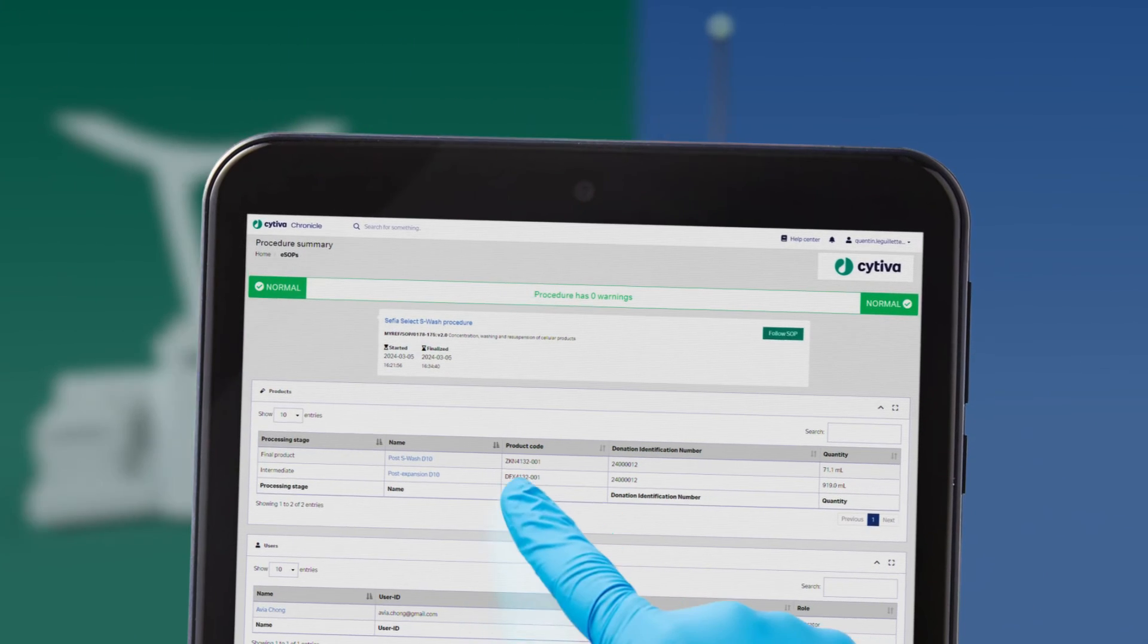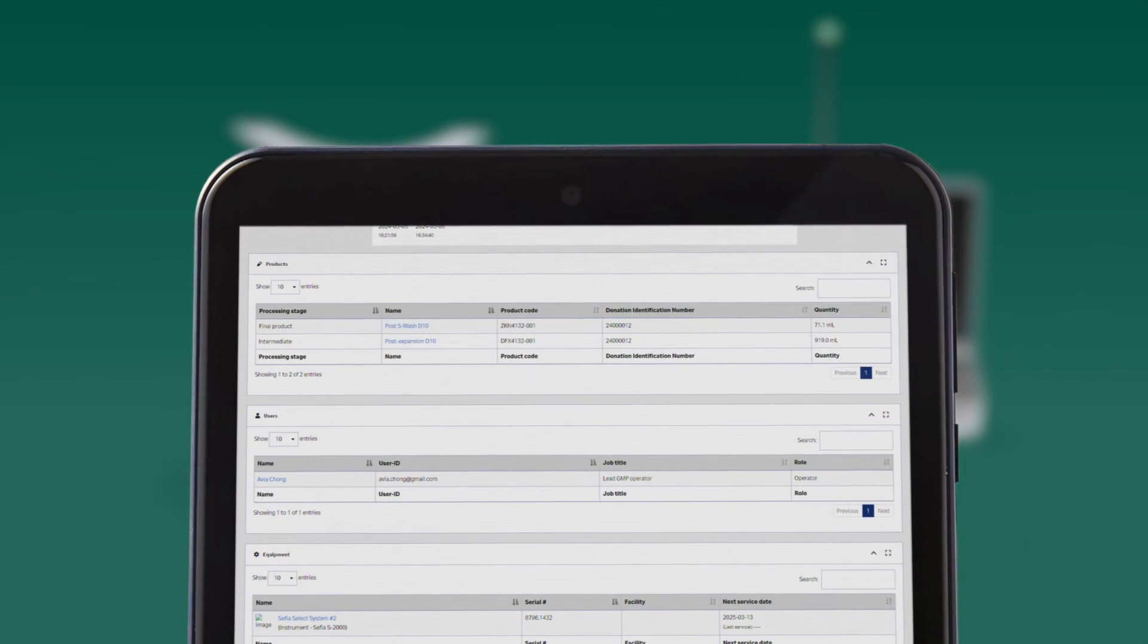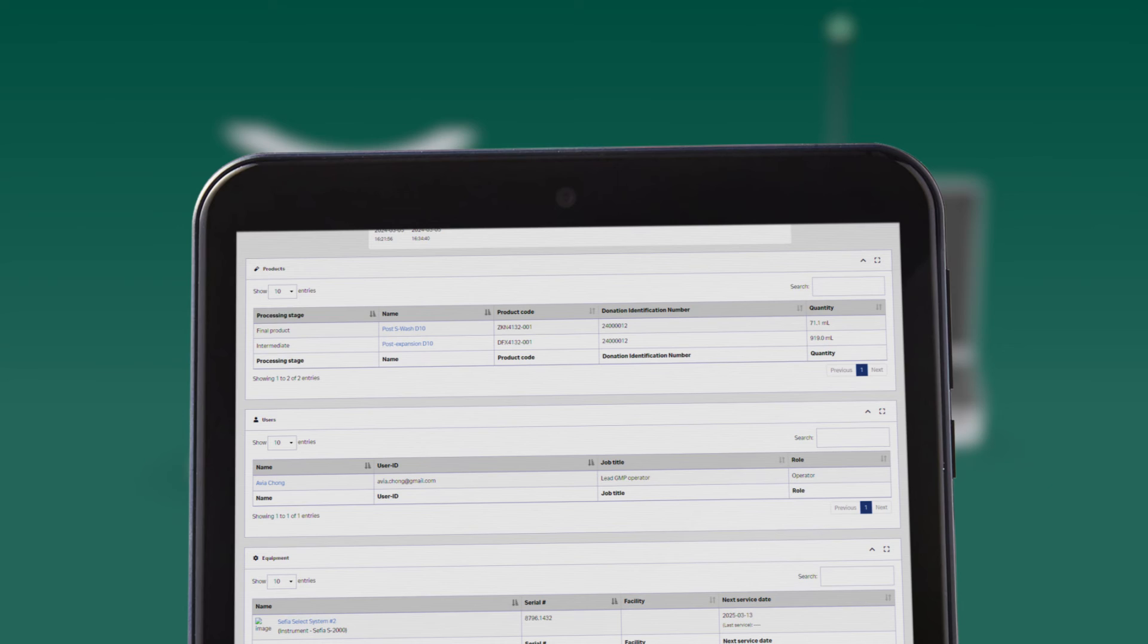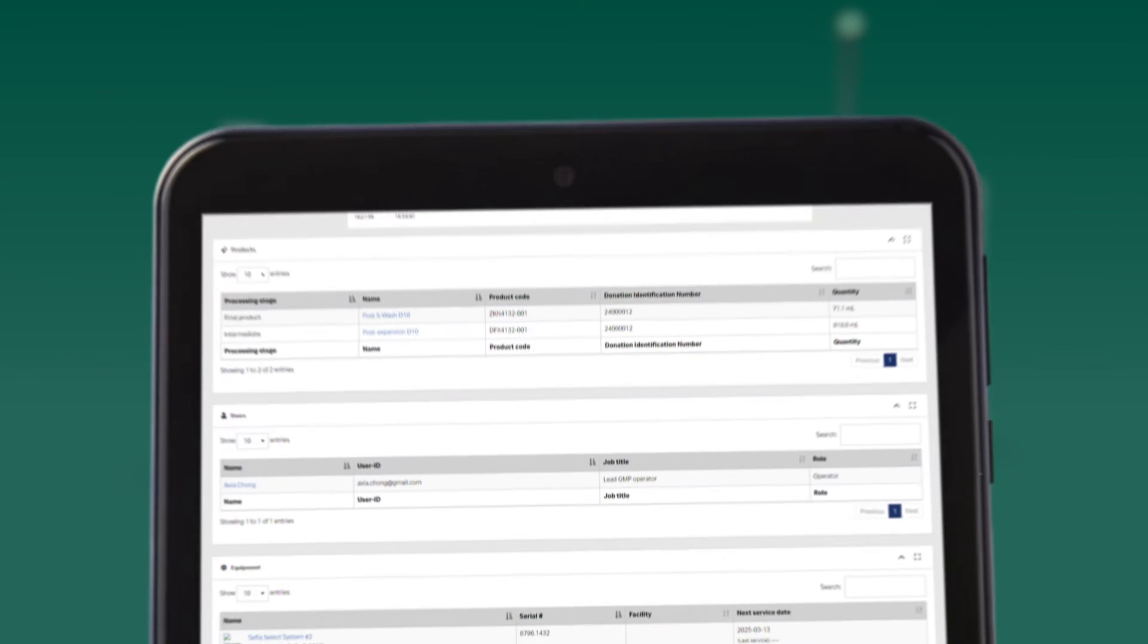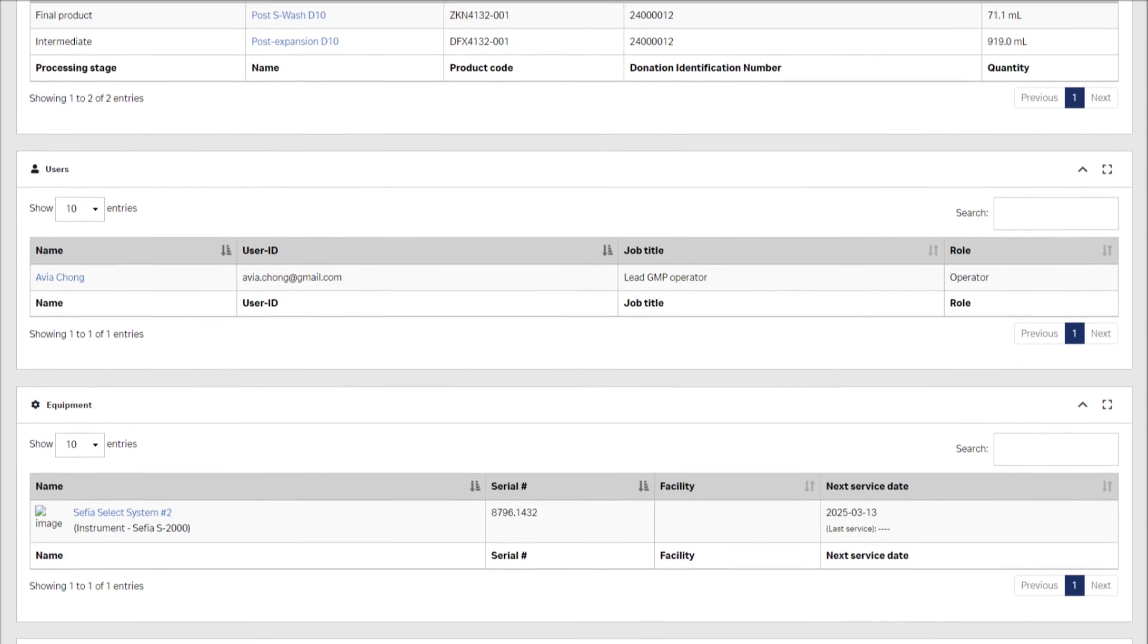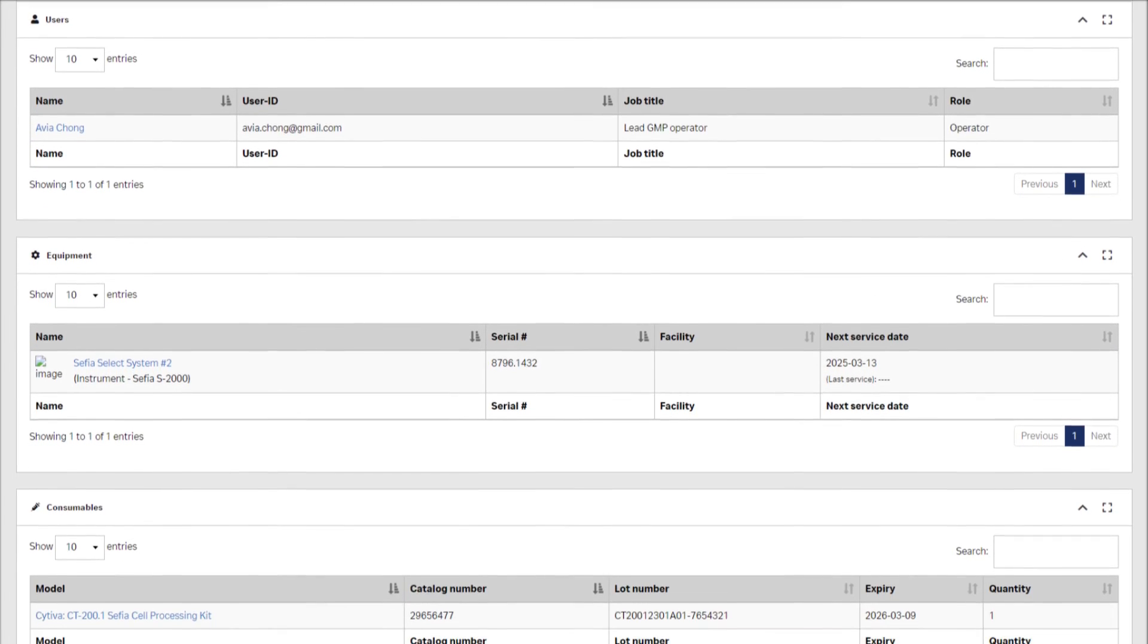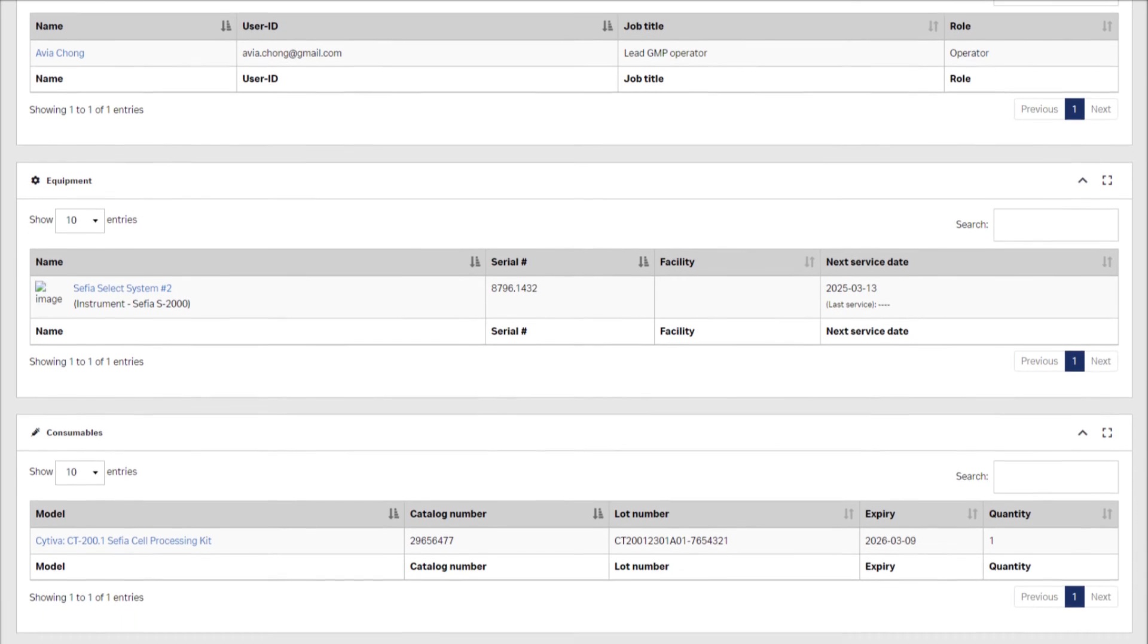By using Chronicle software during your CAR T dose manufacturing, you're able to combine all the information needed to release your dose via electronic batch manufacturing record.